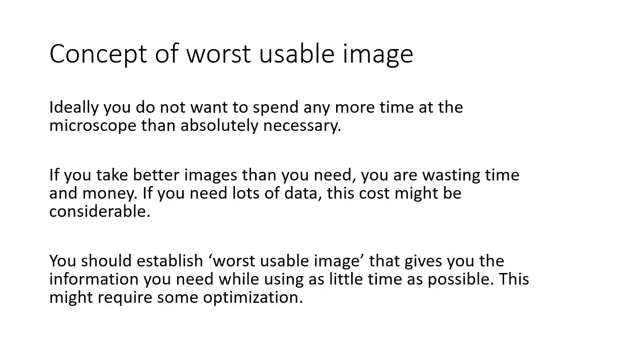And finally, I would like to introduce the concept of worst usable image. So ideally, you do not want to spend any more time at the microscope than you absolutely have to. If you take much better images than you need, of course you can get your results, but you're wasting time and money. And if you need lots and lots of data, this cost might be considerable.